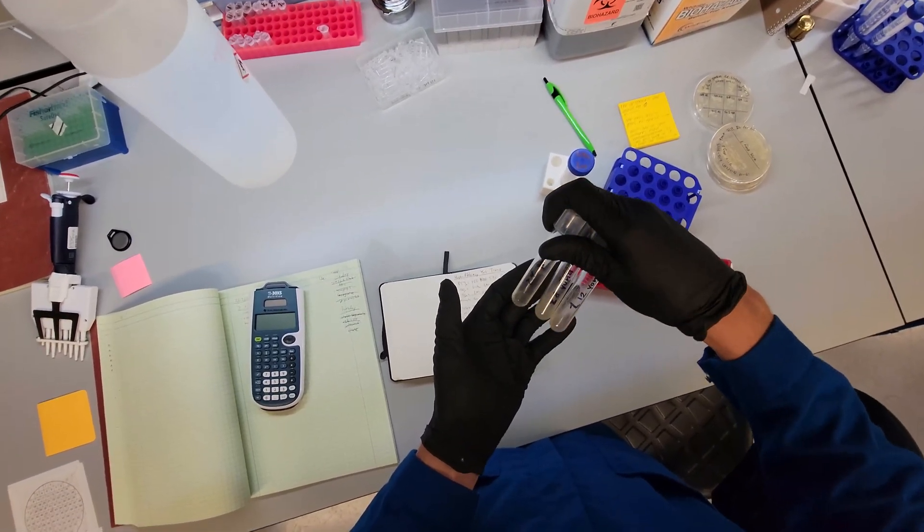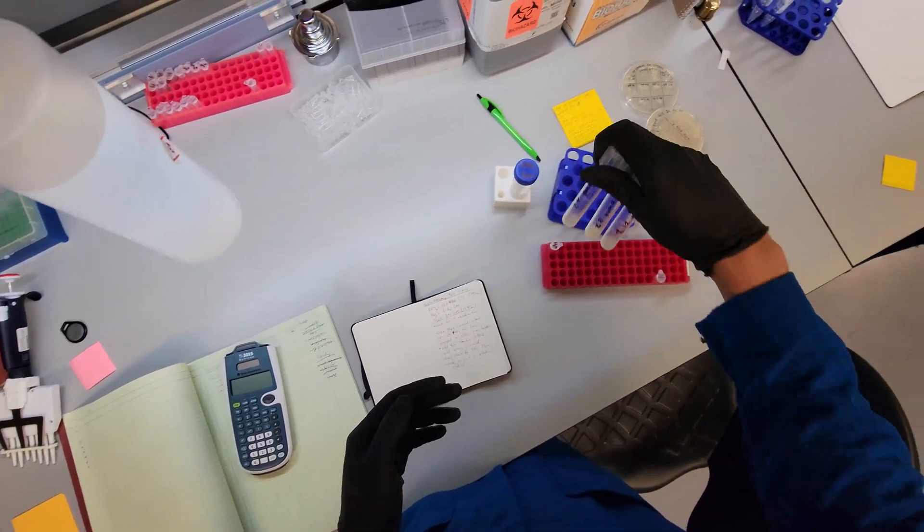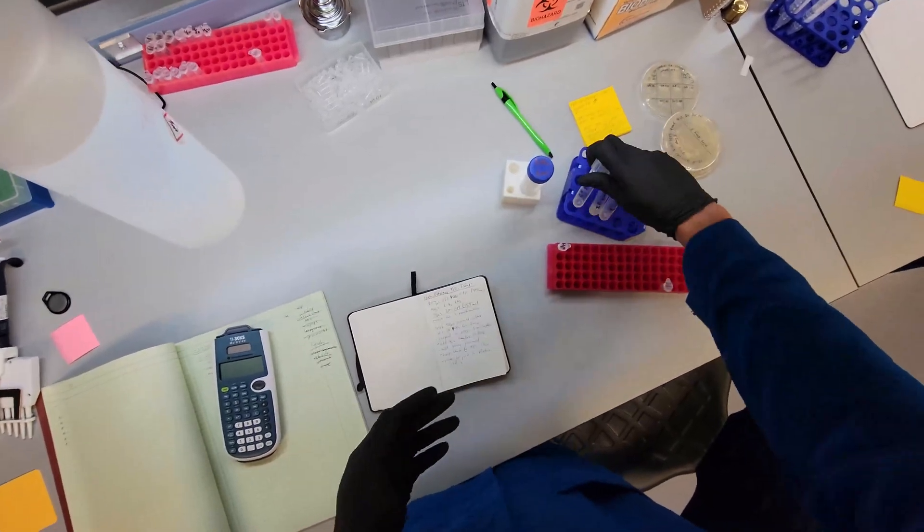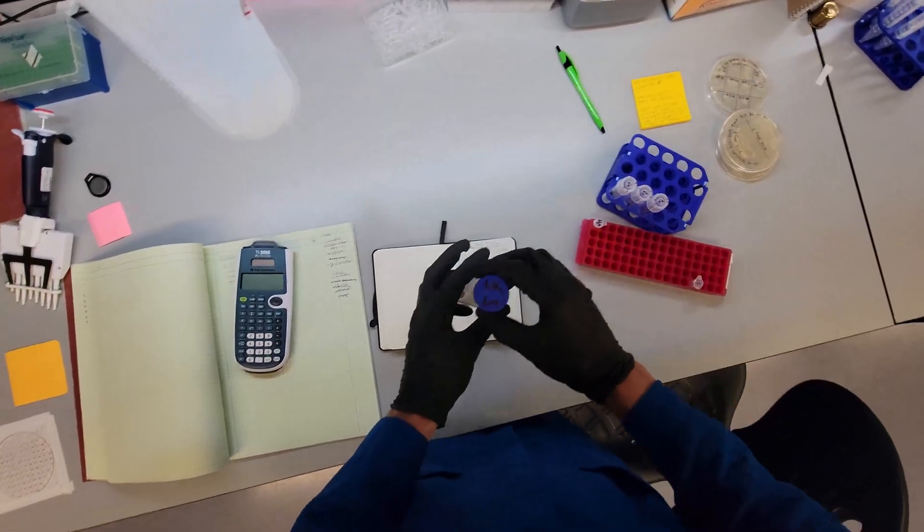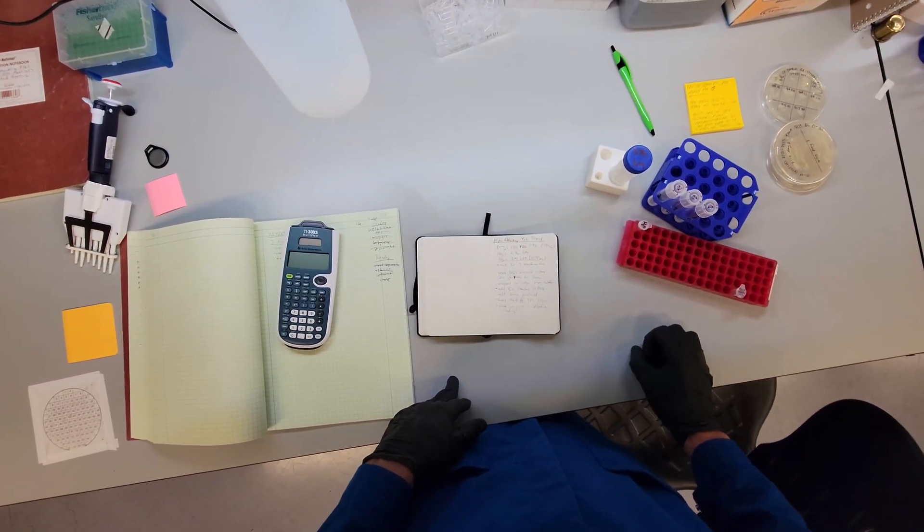Normally when we grow these overnight cultures, we use 2 milliliters, but these cultures have already been used by a lab mate today. But we have enough for our transformations. And then I have my lithium acetate right here. That doesn't need to be made fresh, so I just have a big stock of it.